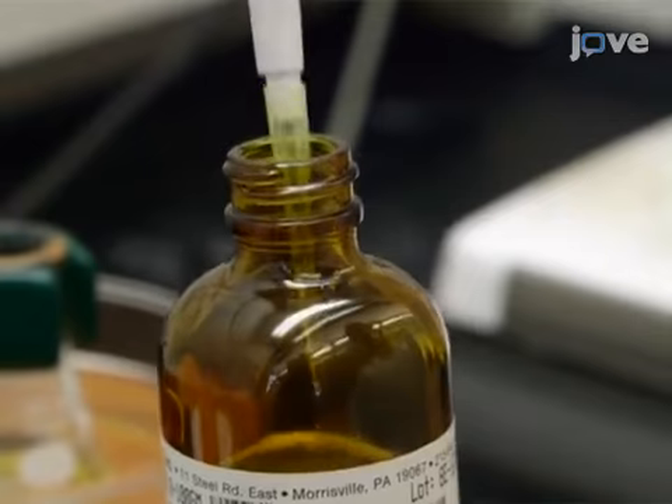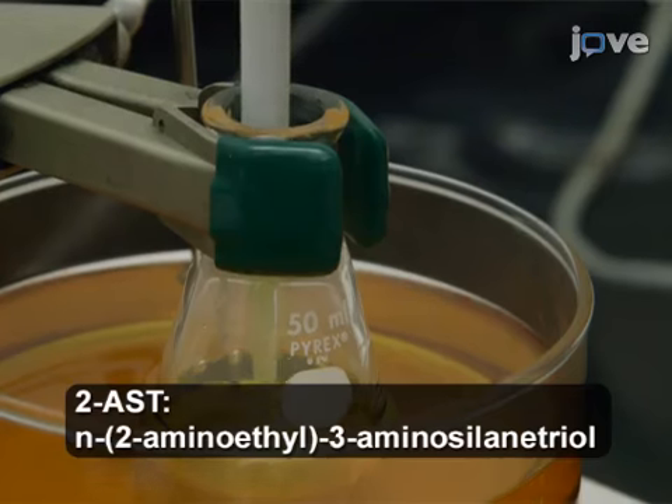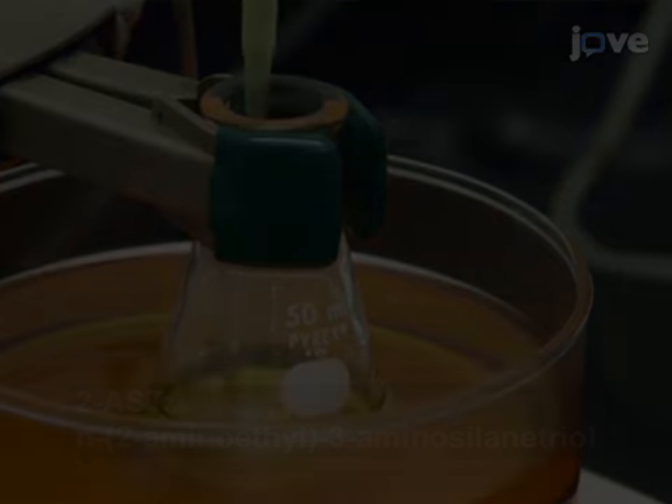Next, slowly add 144 microliters of 2-AST to the flask using a precision micropipette. Flush the pipette.